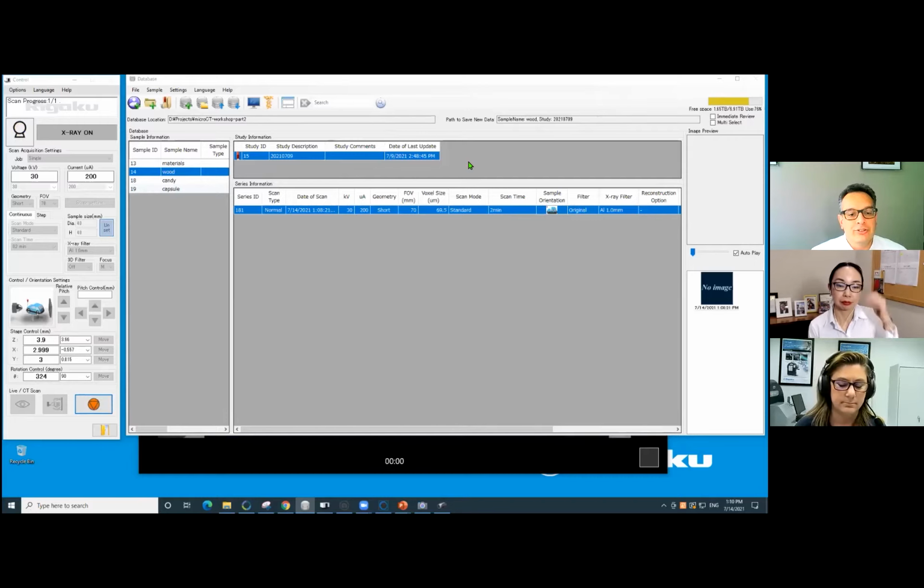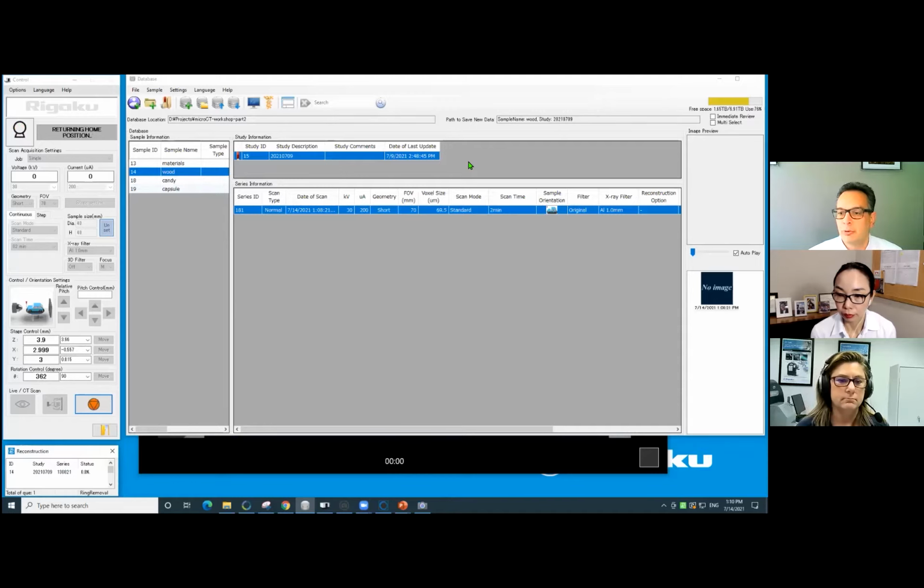This sample looked clearly dry, right? Sat on the forest floor for a while. Would you expect a big difference if it was a fresher sample, right? That had recently broken off, basically maybe freshly cut off of a tree that was pruned, something like that. Yeah, I mean, it would obviously have some water content in it that is not present right now. So there would be higher absorption perhaps, but not a whole lot of difference.